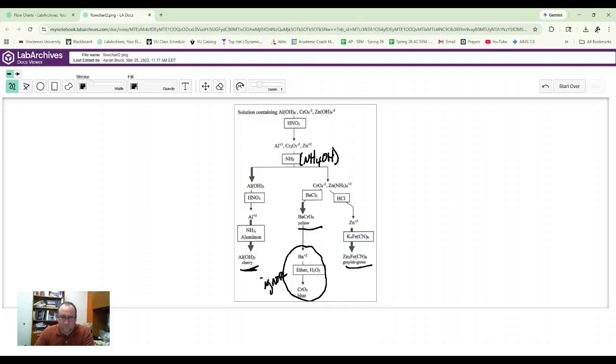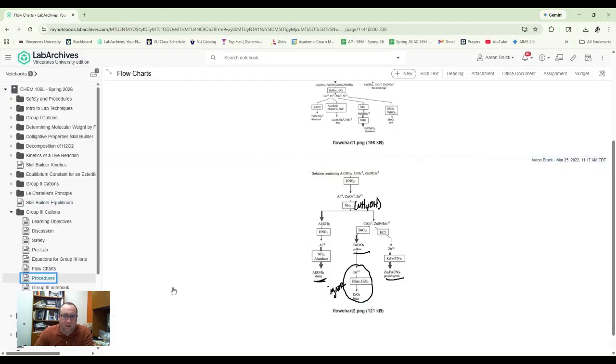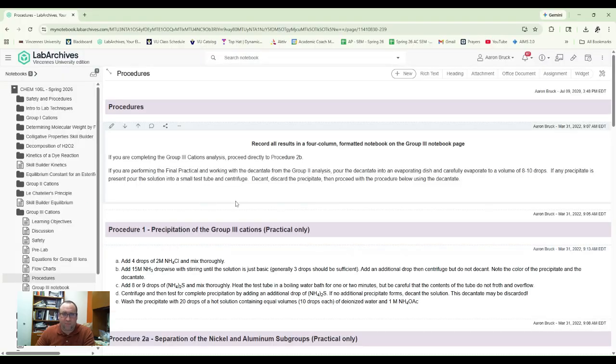And this gives kind of a grayish to greenish color. Where we have to be really careful about this one is that the solution itself has this blue-green tint to it, and so we have to make sure that the solid actually carries that color as well. So procedurally speaking, we have this written in as a 2-day lab.